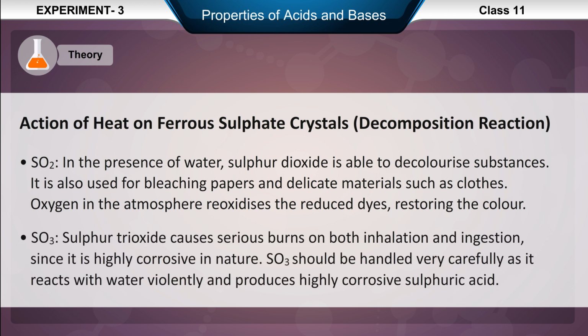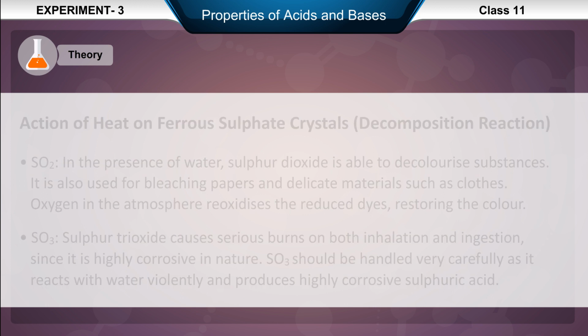SO3, sulfur trioxide, causes serious burns on both inhalation and ingestion, since it is highly corrosive in nature. SO3 should be handled very carefully as it reacts with water violently and produces highly corrosive sulfuric acid.